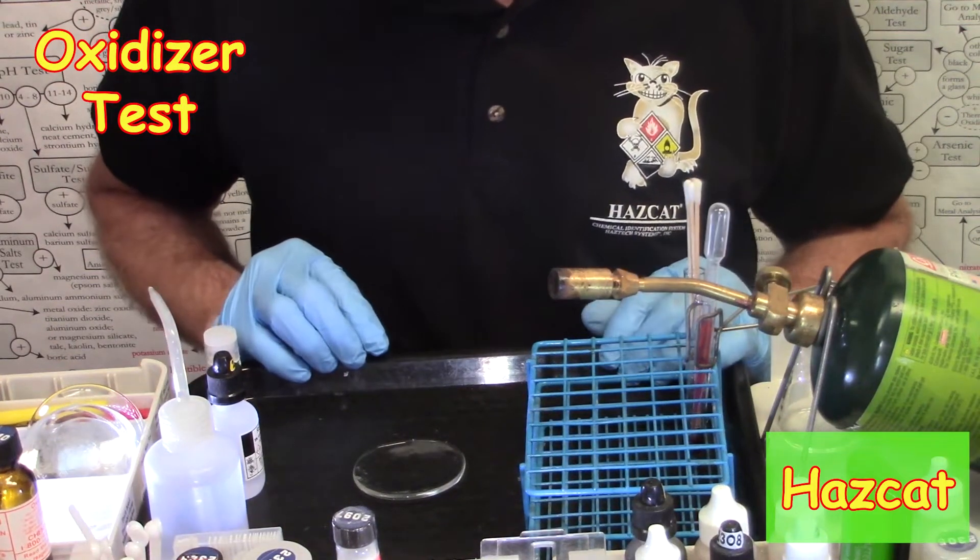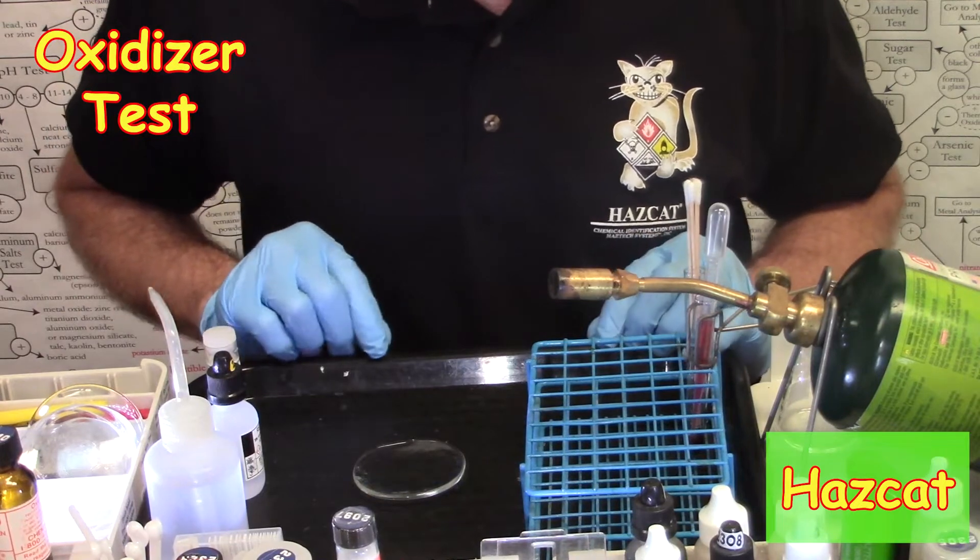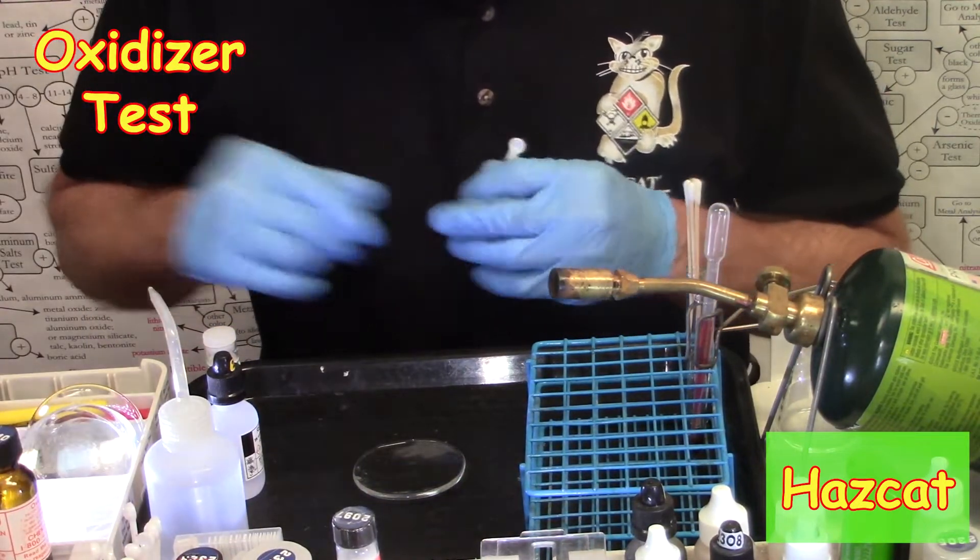Today we're going to conduct an oxidizer test. We start out by placing, if we have a solid, two spoonfuls of the unknown on a watch glass.